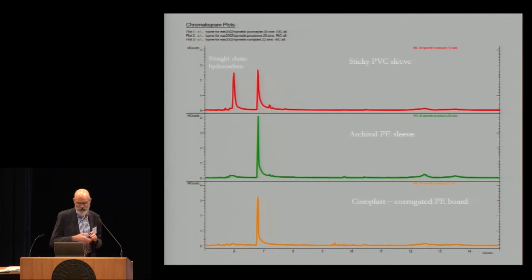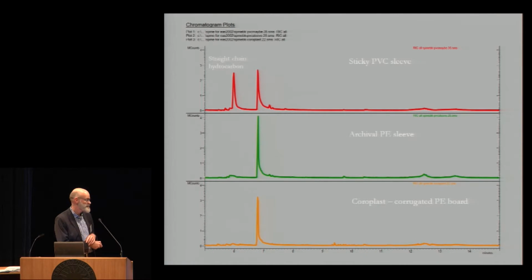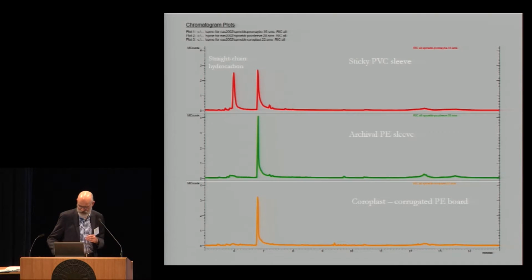Plastic sheeting and films. Here's a bad sticky PVC sleeve, and we get some straight-chain hydrocarbon, and because it's sticky and coming into contact with things, even though this itself is not reactive, obviously you don't want to use this for anything that you want to preserve. And then we have some comparisons with archival PE sleeves and Coroplast. So again, it's just polyethylene, no sites on the chain where you can have any kind of oxidation occurring, so these have been known to be quite stable, and indeed the SPME test shows that to be the case. It also shows that there are no plasticizers in these, because this would also show up plasticizers.